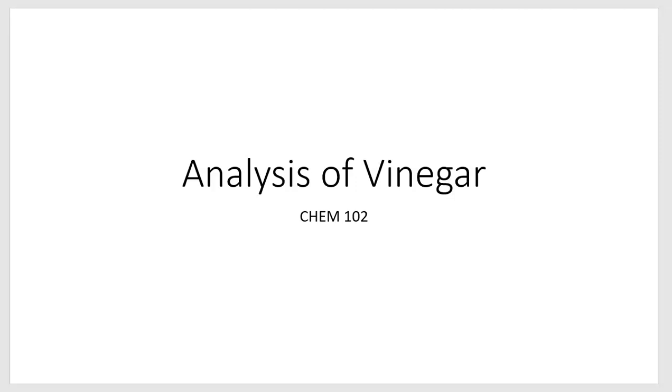Hi, this is a pre-lab talk about the theory and calculations behind the Chemistry 102 experiment on analysis of vinegar.